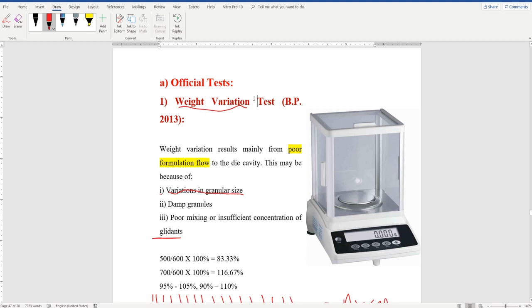because it is required for the potent drugs and for drugs in the tablet with very low percentage. Because of that, you do not need to do weight variation test, because if there is no significant difference in the chemical content, in the uniformity of chemical test, between the tablets, there is no difference, then we really don't care a lot about the weight variation test, because now we are sure that the tablets will have similar-ish content of drug.